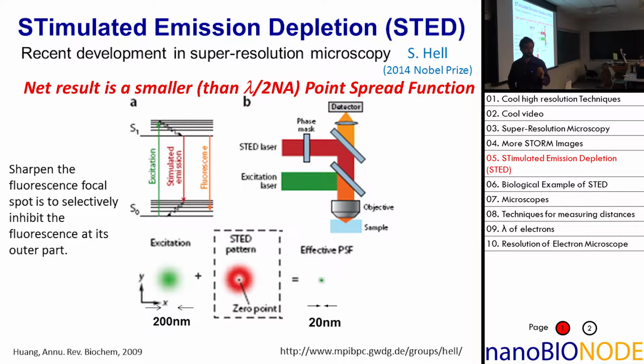Now I'm going to tell you about another mechanism which I think is really cool, which is to get high-resolution fluorescence in a totally different way.